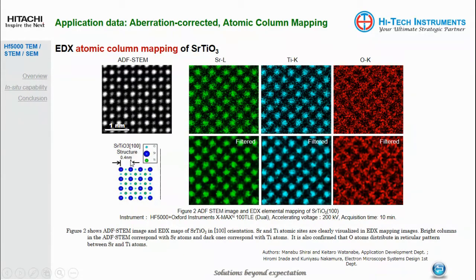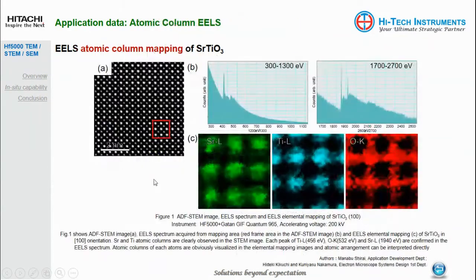This is the modeling for strontium titanium oxide viewed along 100. So it matches exactly your experimental data and your theoretical modeling. And the next one is another example.